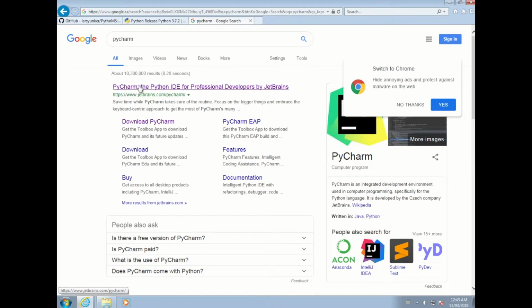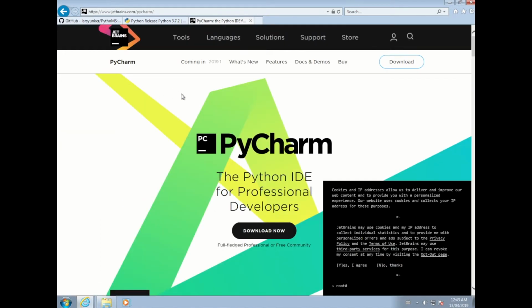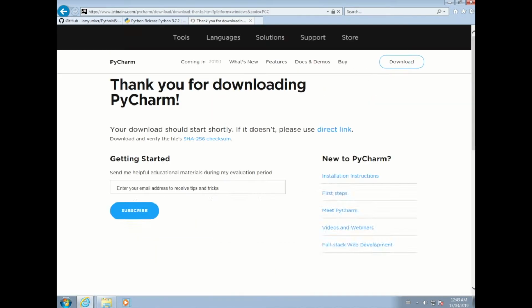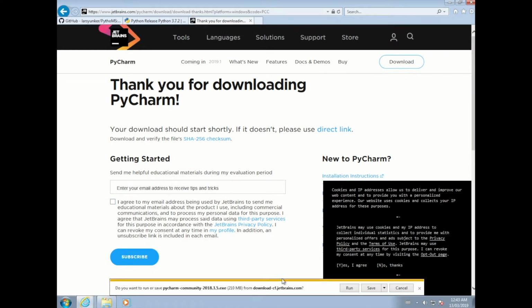So next you go to PyCharm and just download the software. Community version is free, and this will run the Python script.